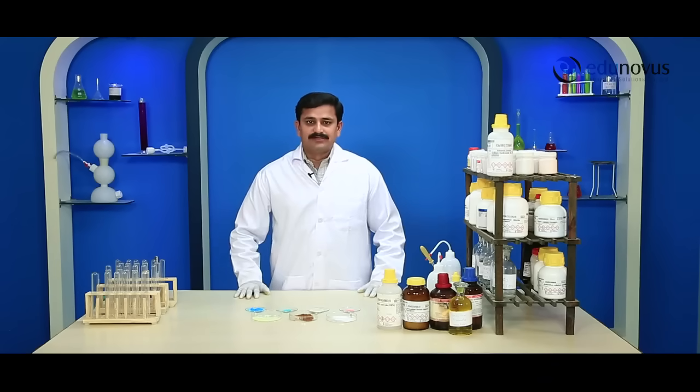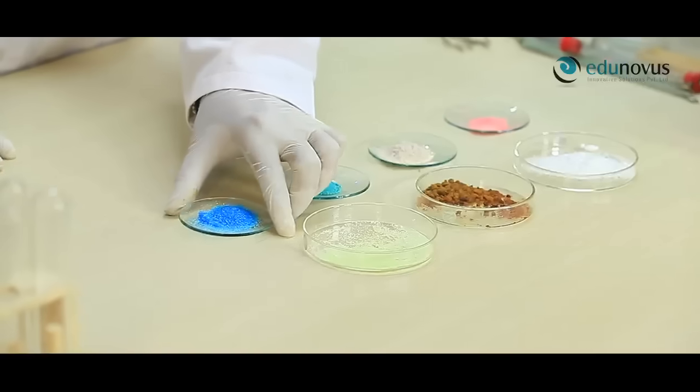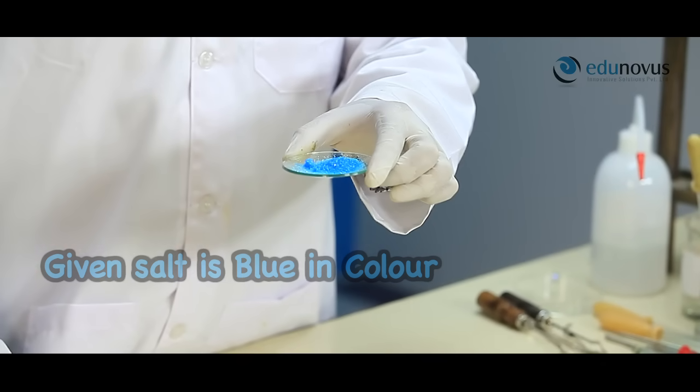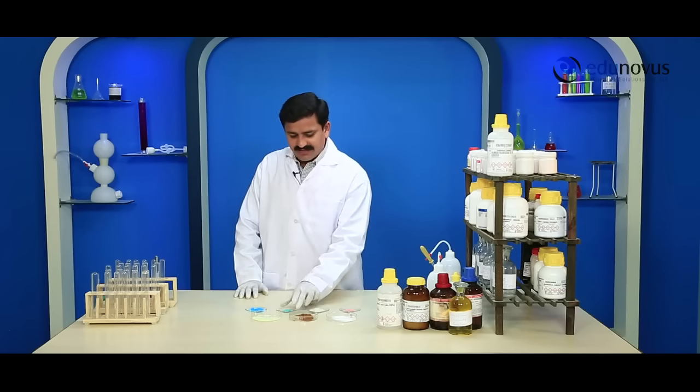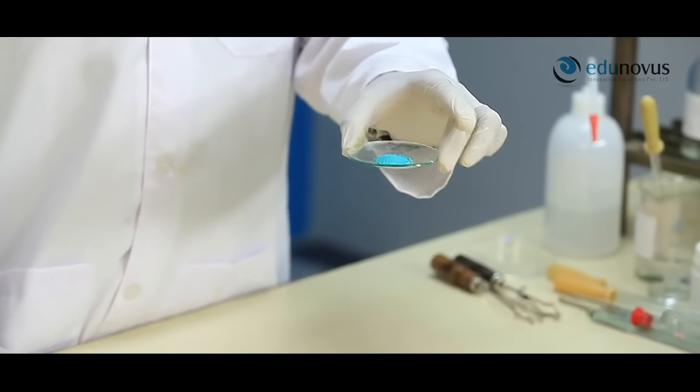Let us examine the physical appearance of the salt. Firstly, color of the salt. If the given salt is in blue color, it may be a copper salt. If the given salt is in light green or bluish green color, it may be a nickel salt.